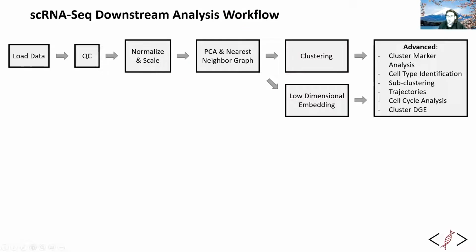All right, so what have we done so far? Well, we previously talked about how to load the data, do quality control, and normalize and scale it. Wes mentioned SCTransform, which I actually personally use. I just didn't use it in this workshop series because it is slower and it can cause some other issues when you try to use functions that want you to have log transformed counts. But in general, it's the one I would personally use. So he showed what that is. It was the SCTransform function in Seurat. So it's a great alternative. I'll probably put it in the script for next lecture.